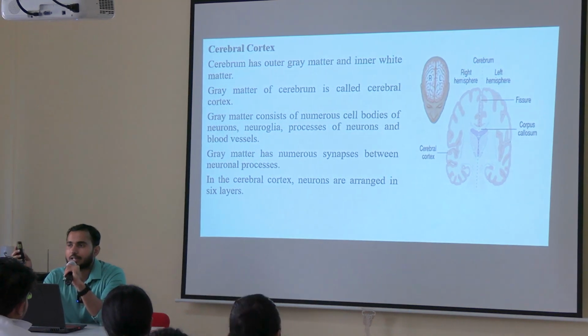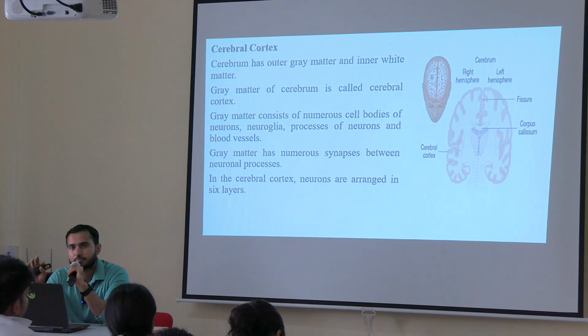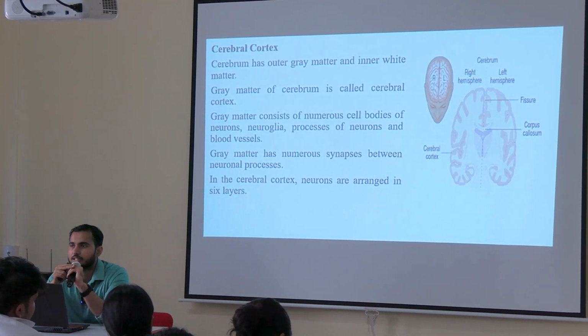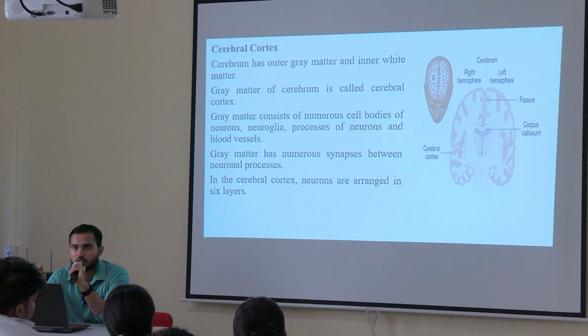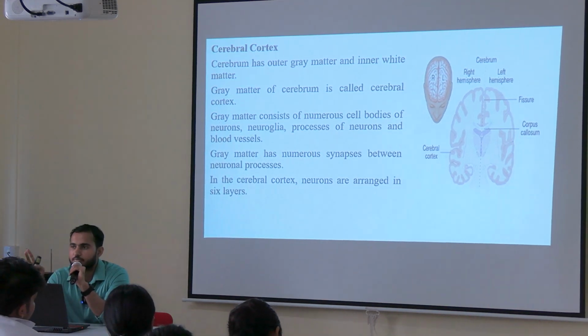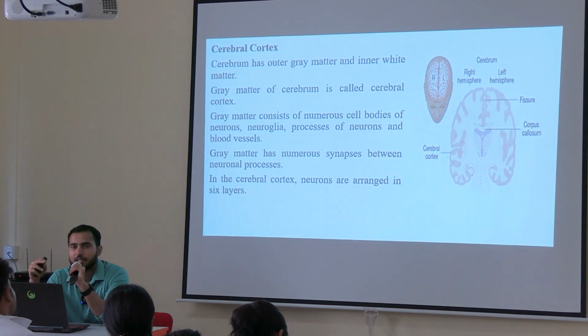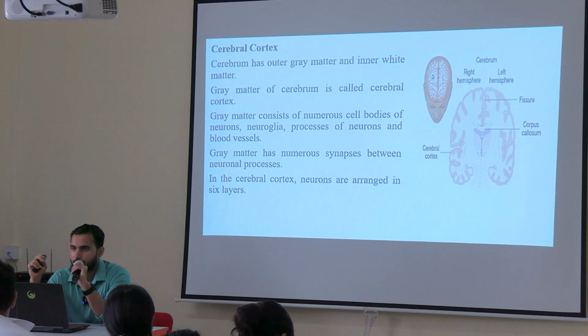What I am planning is this slide of cerebellum will be kept for the practical exam. Identification of those slides is very easy. Okay, very easy. If you see once, you will identify. So that's why I am planning to keep those slides.